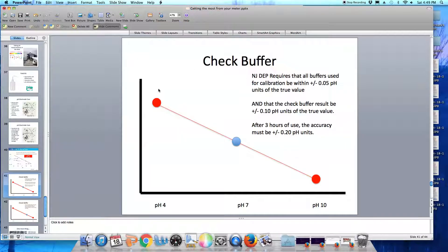When we calibrate at pH 4 and then we calibrate at pH 10, we would then take a pH 7 buffer and read that buffer. The value that we get from reading this pH 7 buffer must be within plus or minus 0.1 pH units of pH 7. So any value between pH 6.9 and pH 7.1 would mean that our meter has been properly calibrated and is ready for use.